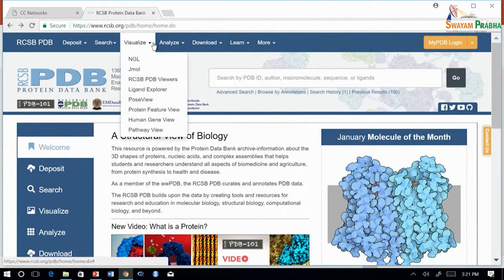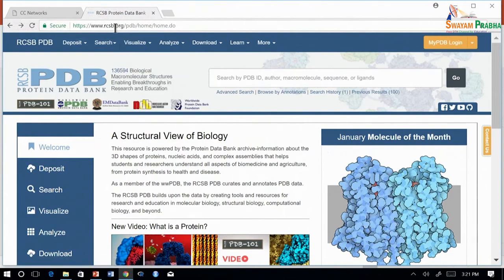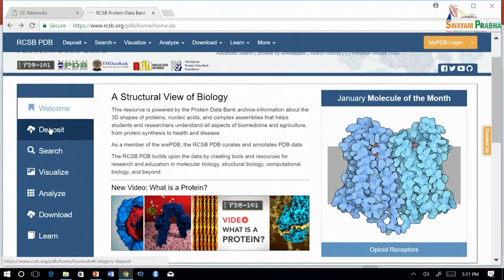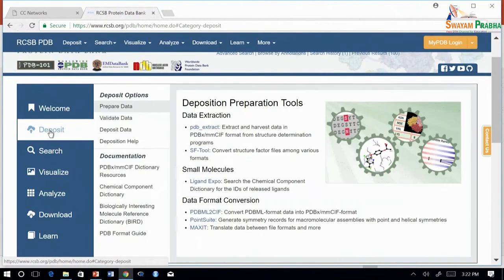First go to this URL rcsb.org/PDB. You can click on each menu item on the left side to learn about the resources available in PDB. In the deposit menu item, experimentalists can deposit their data which is biological structures elucidated by x-ray crystallography or NMR.